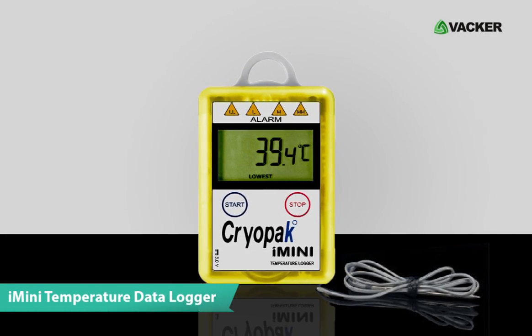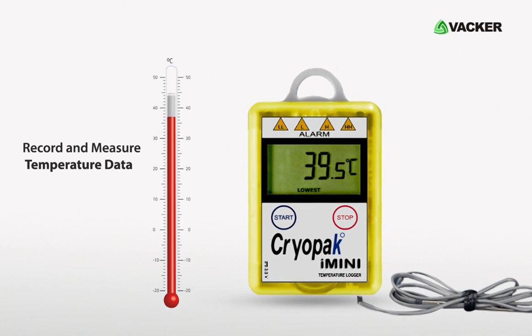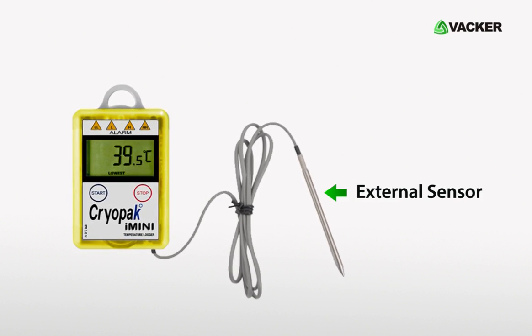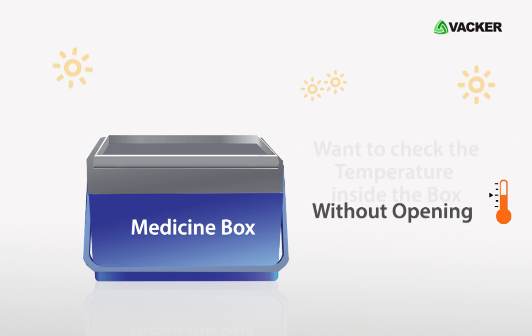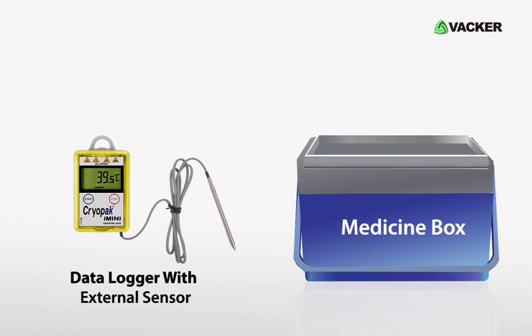This is the iMini Temperature Data Logger with External Sensor. This device monitors and records temperature data using external sensors at a place where data loggers cannot be placed. If you have a medicine box and want to check the temperature inside the box without opening it, you will require a temperature data logger with an external sensor.